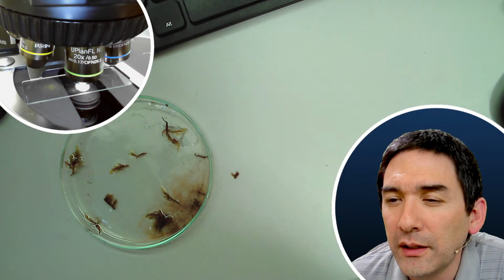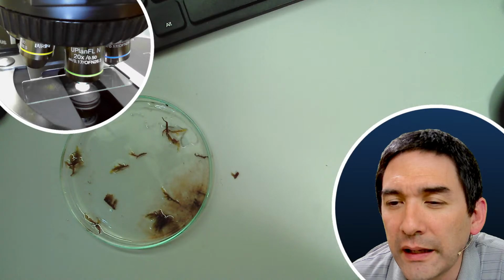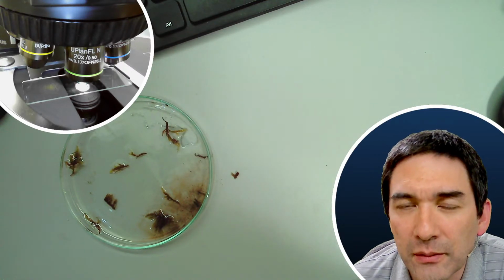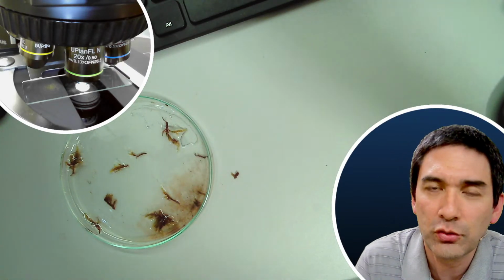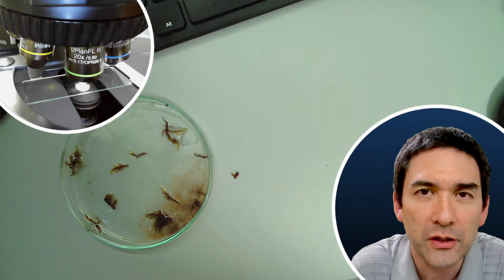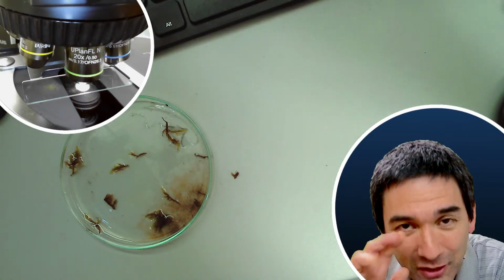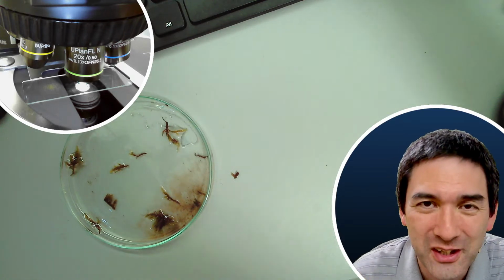It is a painful process to determine the exact location of dust in the light path. Cleaning it is another pain. Air removal might not work due to the charges on glass. Yeah, so basically if there is some kind of an electrical charge, then it's possible that it statically attracts the dust. I found that most of the dirt actually starts to accumulate on the eyepieces, because when you are close, the eyelashes touch the surface of the eyepiece, and this is a little bit greasy, and then of course the dust also likes to stick.